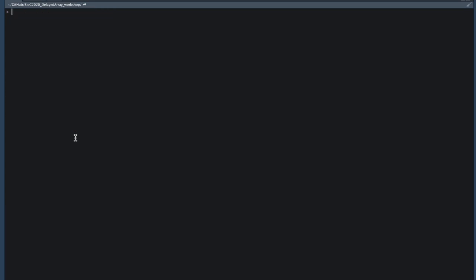These three examples highlight the power of the DelayedArray framework. Recall that the data in these examples actually live on disk in an HDF5 file, yet we interacted with the data and computed on it much as we would as if the data were in memory as an ordinary matrix. All three examples returned ordinary R vectors. The computations for these three examples made implicit use of the three fundamental concepts in the DelayedArray framework: delayed operations, block processing, and realization. We will now discuss each of these in some detail.